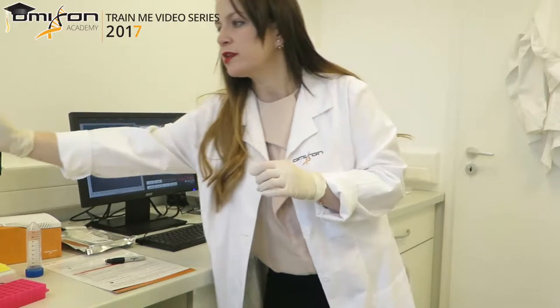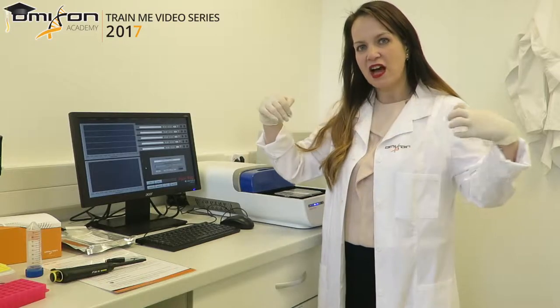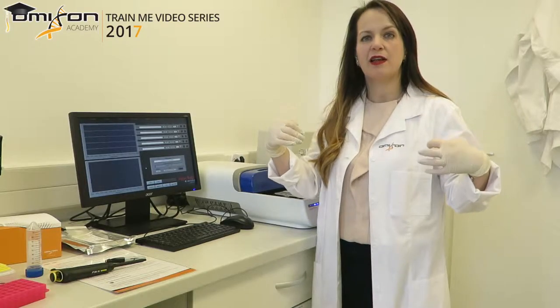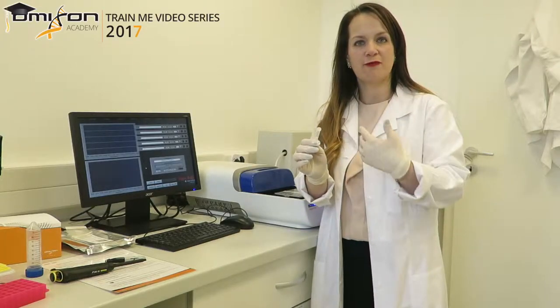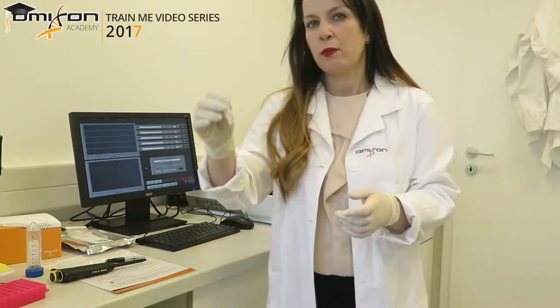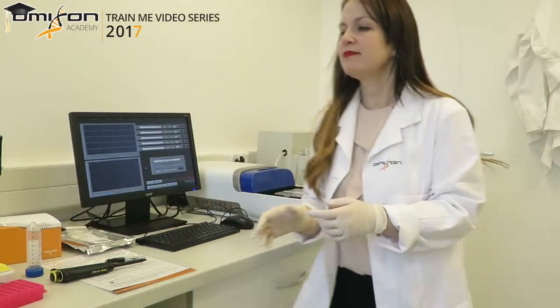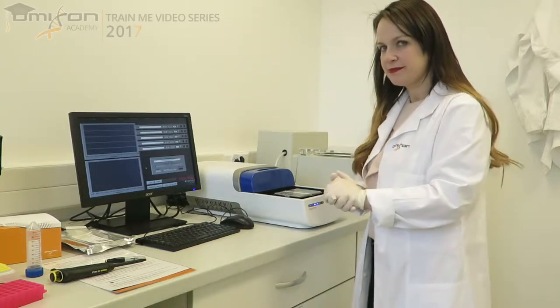It is very important that from this step onwards we use only low-bind tubes. Libraries have properties that cause them to stick to regular plastic walls, but low-bind tubes have internal walls treated with a substance to prevent sticking. As a result, we don't lose any library and have plenty to move forward with. We keep the library on ice and continue to the next steps.